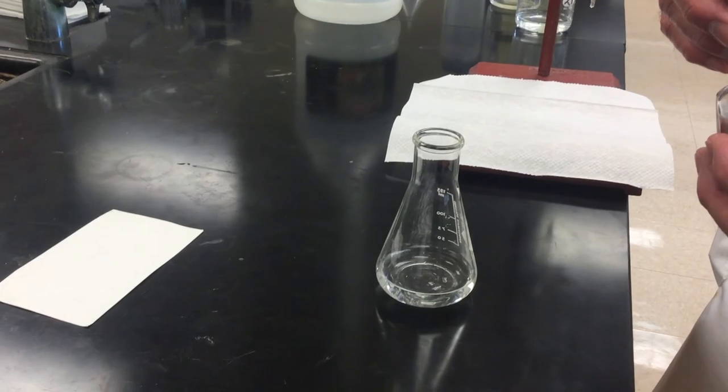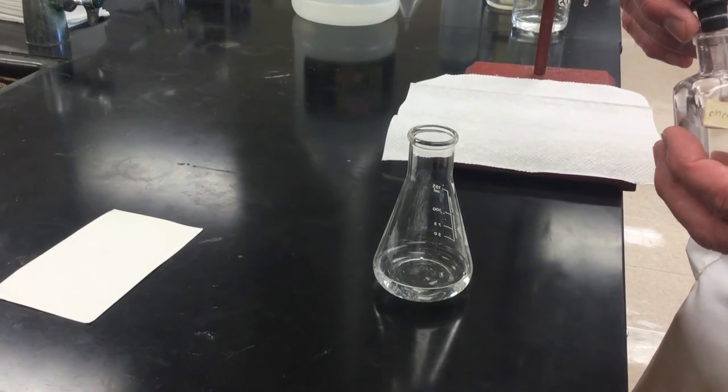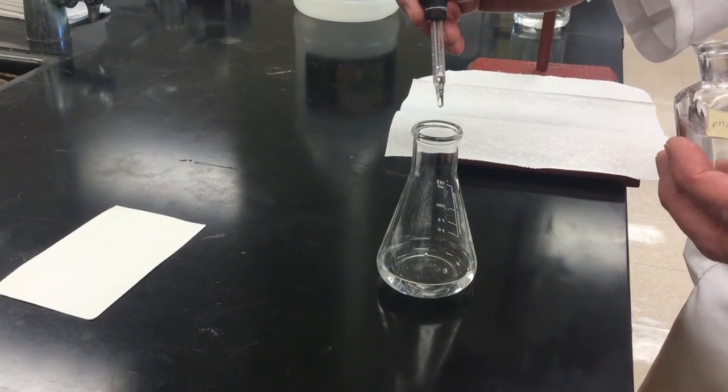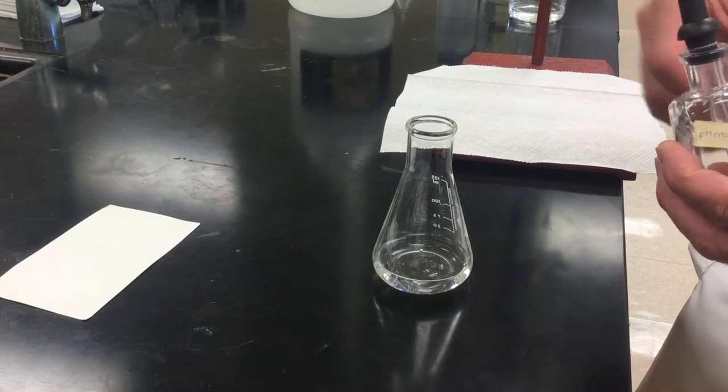In this experiment, you always want to make sure that you add phenolphthalein to your acid mixture. Phenolphthalein is a color indicator that will let you know when the reaction is complete. Always remember to add one or two drops.